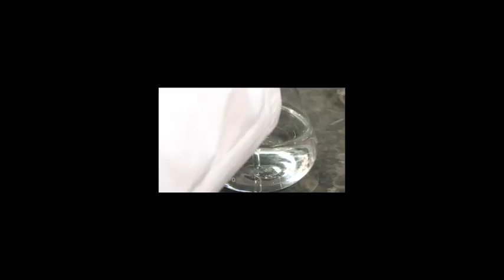And if there are any big chunks of sodium oxalate, you can crush them with a glass stirring rod so they'll dissolve. So just to recap step 5, we added our 250 milliliters of 1 molar sulfuric acid to our sodium oxalate and swirled it or stirred it with a glass stirring rod until all of it was dissolved.